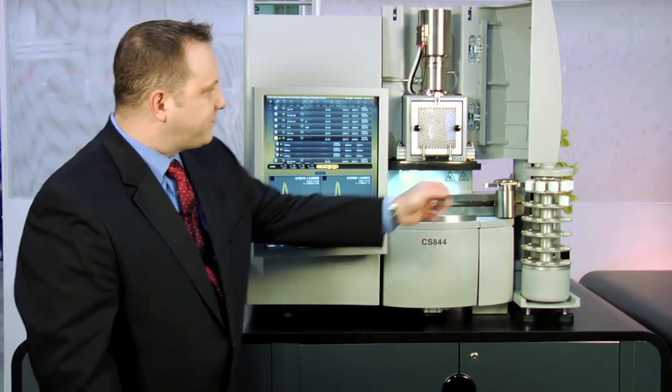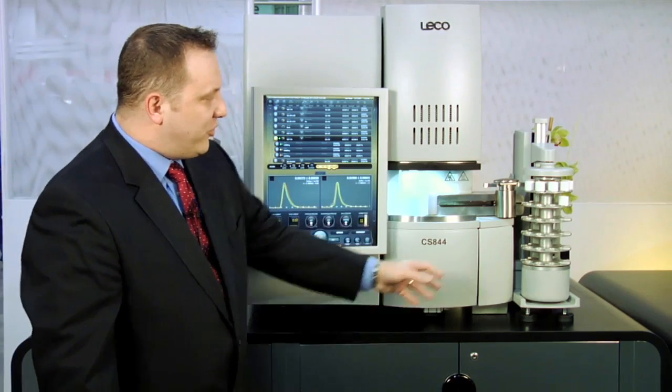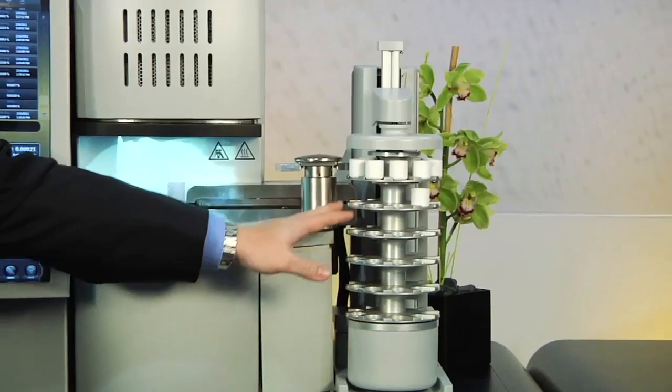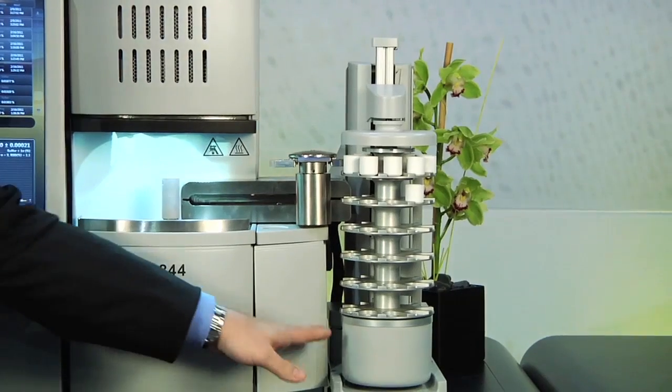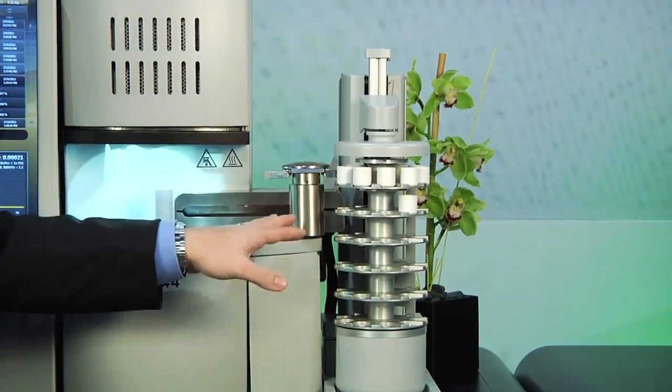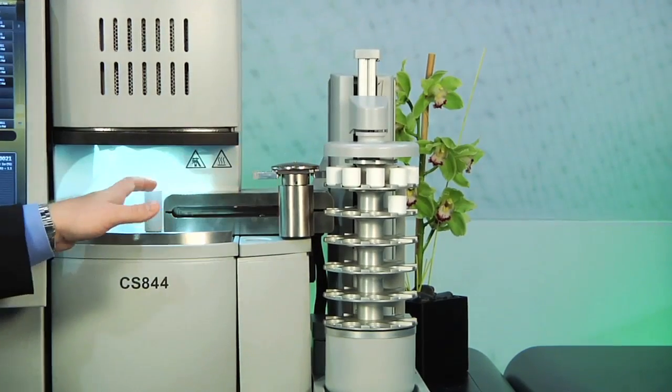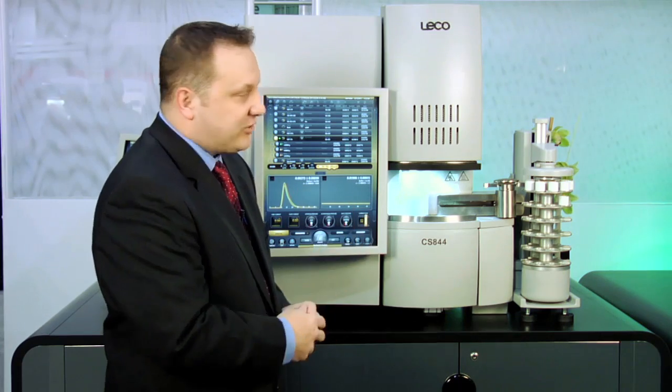This system is also equipped with our optional 60 position shuttle loader. The system utilizes six 10 position carousels on a vertical assembly that will raise and lower those carousels so that the shuttle grippers can pick them and place them on the crucible. The key to this system is the simplicity in design and the lack of complex movements.